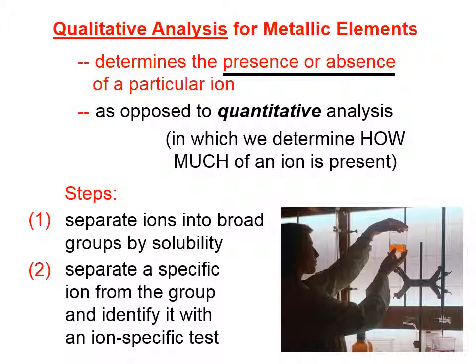It's almost as if we have a bunch of baseball cards and we separate them first according to team. We put the Yankees over here and the Cubs there and the Red Sox there and the Twins there. And then we pick up the cards that are Twins and then we separate them into pitchers and catchers and infielders and outfielders and so on. That's kind of what we're doing with qualitative analysis. Let's kind of show you how this works. And again, I'm not interested in my students knowing the specific details. I'm interested in them knowing the general process.